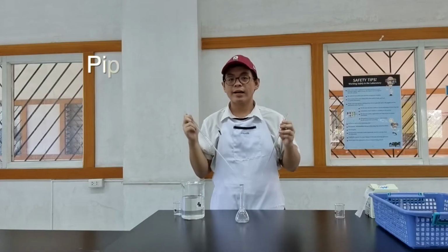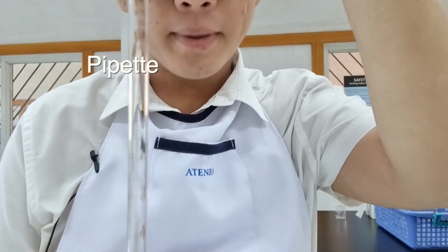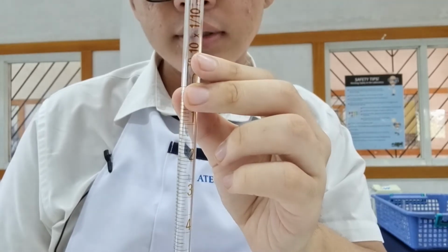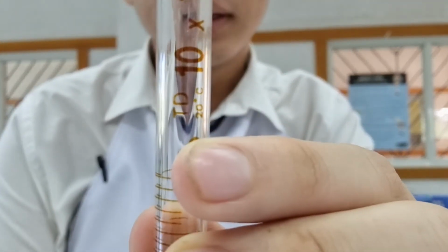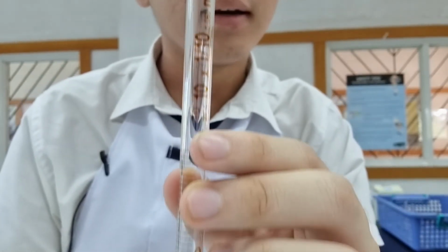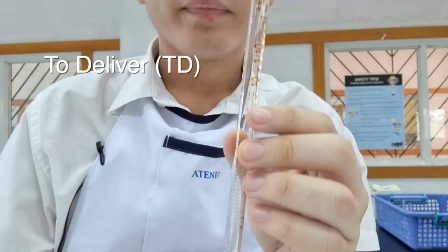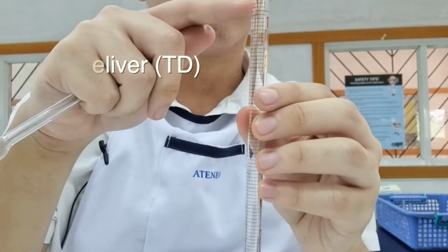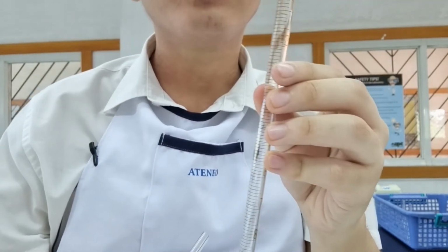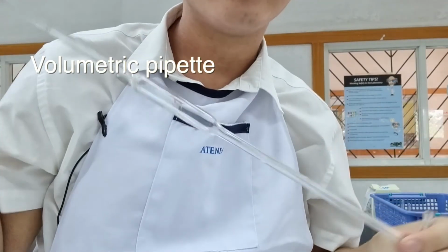A pipette will allow you to accurately transfer volumes from one place to another. So for this pipette, notice that it says 10 ml and it also says TD instead of TC. Again, TC stands for to contain. A pipette is TD, which means to deliver. That means if you start at 0 and then finish this up to 10 ml, that means you delivered 10 ml.